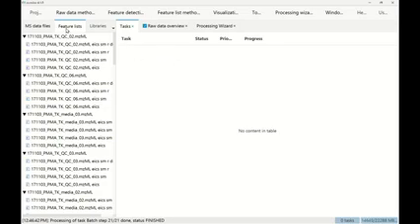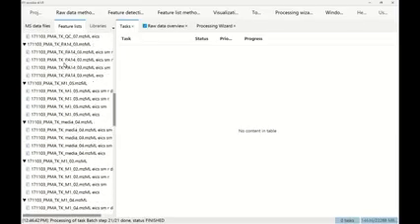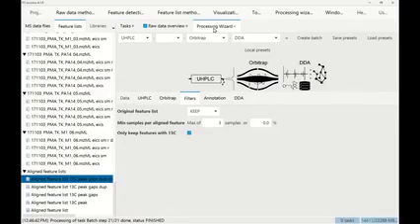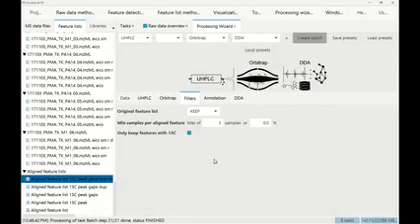So was everyone able to generate some feature lists? I think you might only see one or two feature lists, actually, if you click on the MS data files on feature lists here on the tab. And if you were not able to, we were in the processing wizard, so processing wizard, and then create batch and OK to run everything. Okay.